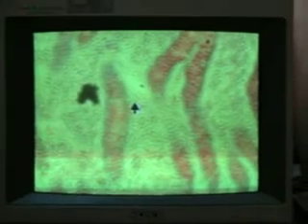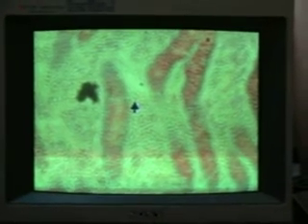The next slide is hopefully nicer, and that's the duodenum and ileum. I always ask, why did they put the duodenum and the ileum right next to each other? I used to joke with the students that we have to see the duodeno-ileal junction, but there is no such thing, right? Because they are not connected to each other. So on this section, we're going to see one of the duodenum and one of the ileum. You just have to recognize which one is which.